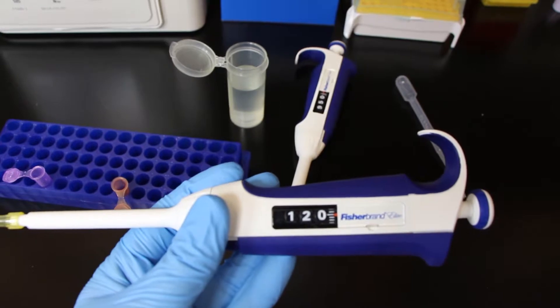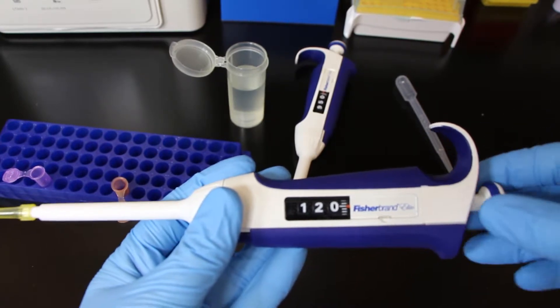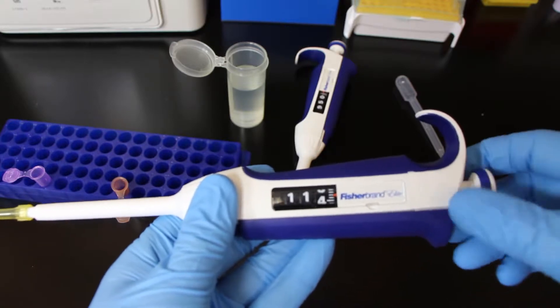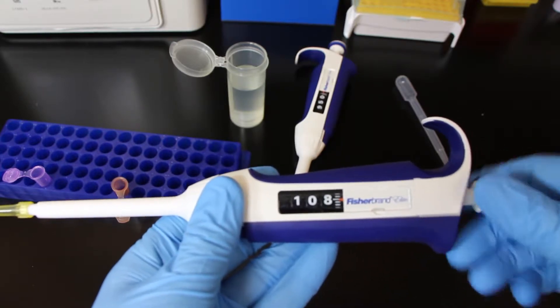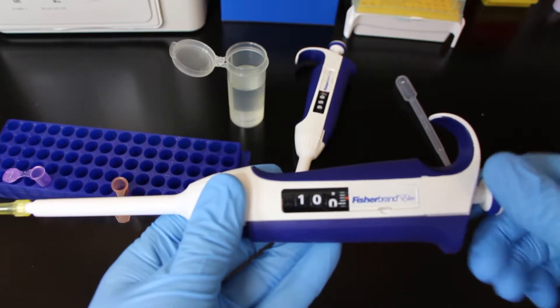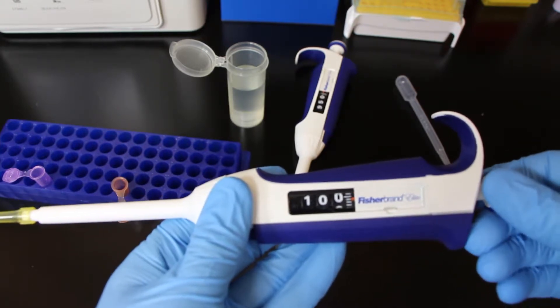The precision pipettes all have adjustable settings to them, at least the ones I'm showing you here today. If you go to the knob at the top, that knob is able to twist one way or the other. If you twist it to the right, you should see the values get larger on the little screen on the pipette, and if you twist it to the left, you're going to see the numbers get smaller. That screen shows you how much volume that pipette is going to suck up when you go to suck up a sample.